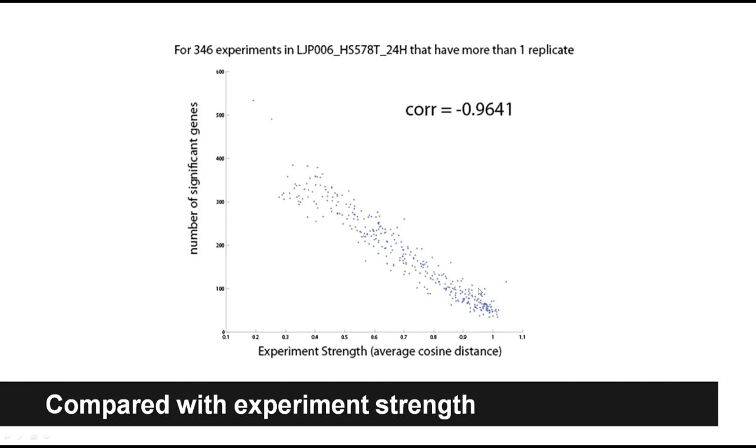I think this is a better approach than the Broad Z-score cutoff, where if you query their API, their differentially expressed genes will be basically the top 100 upregulated genes by Z-score and the top 100 downregulated genes by Z-score, across all the experiments irrespective of their experimental strength.